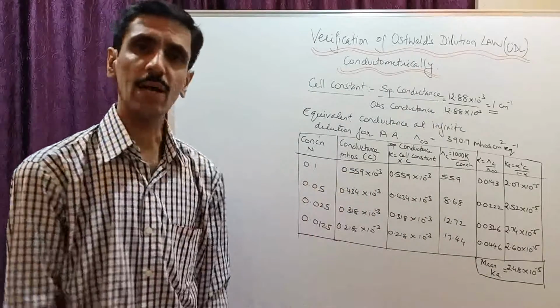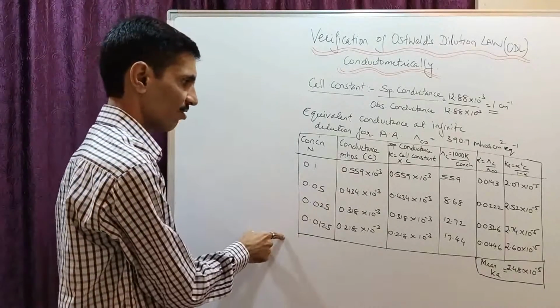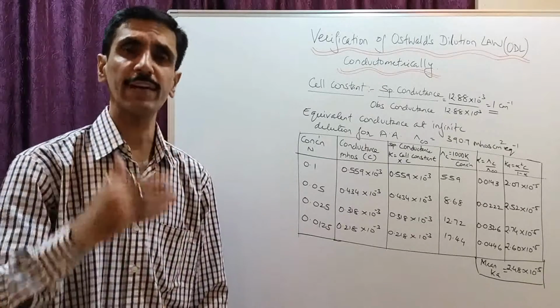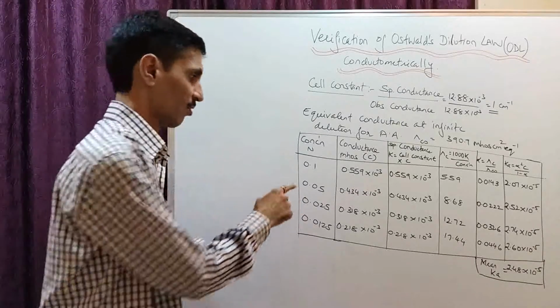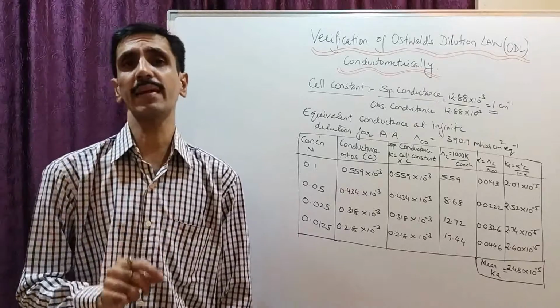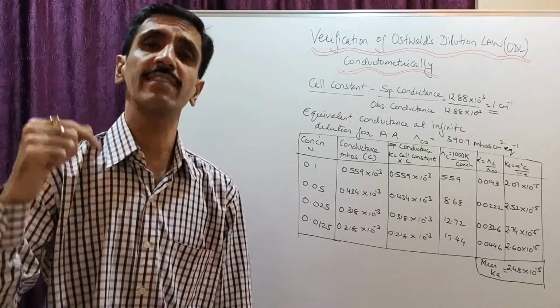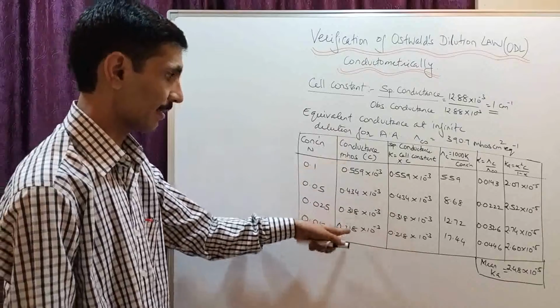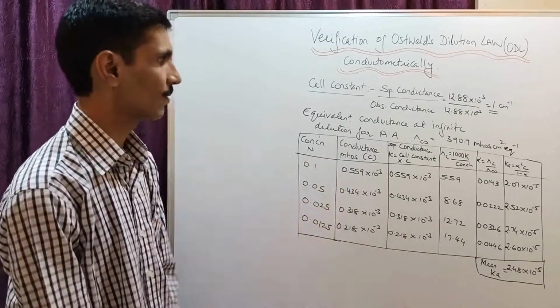अभी बात करेंगे ऑब्जर्वेशन टेबल के बारे में. The first column is concentration for solutions. 0.1 was SS, that is stock solution. उसमें से मैंने 0.05 बनाया, 50 लेके 100 तक डाइल्यूट किया. फिर 0.025 के लिए मैंने 25 लेके 100 तक डाइल्यूट किया. And then we went into 0.0125, 12.5 लेके 100 तक डाइल्यूट किया. हमने कंडक्टेंस वैल्यू नोट किया, आप लोग ने ऑलरेडी देखा होगा वो. Okay, so these are all the conductance values.